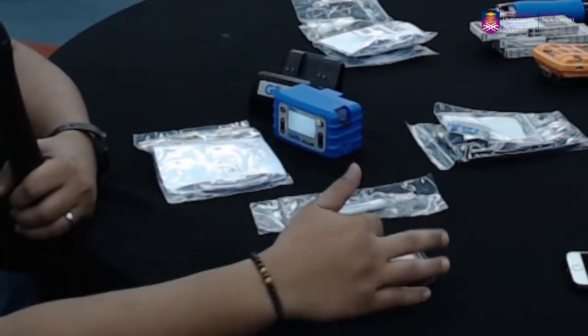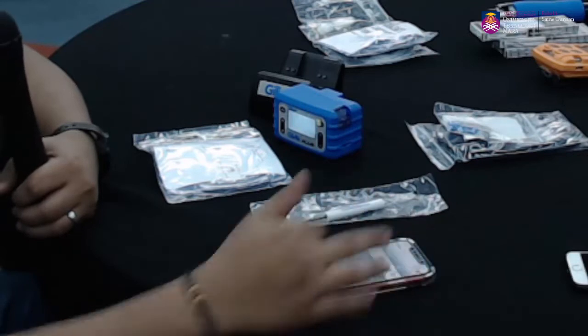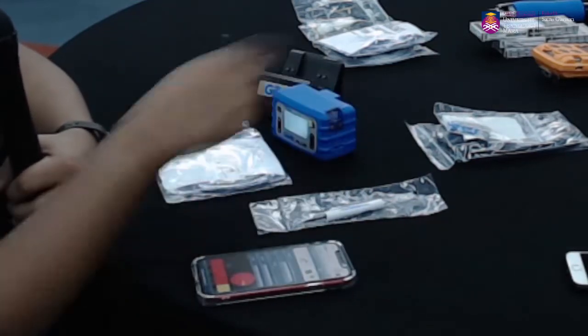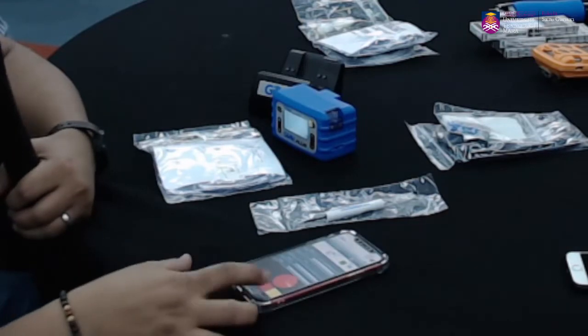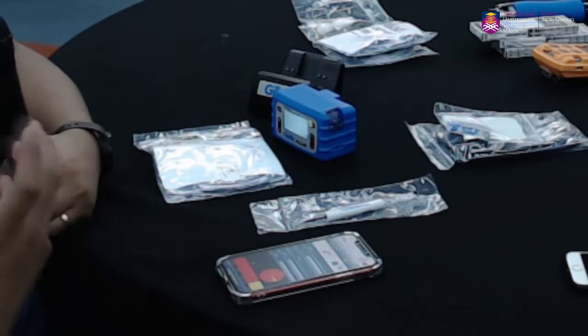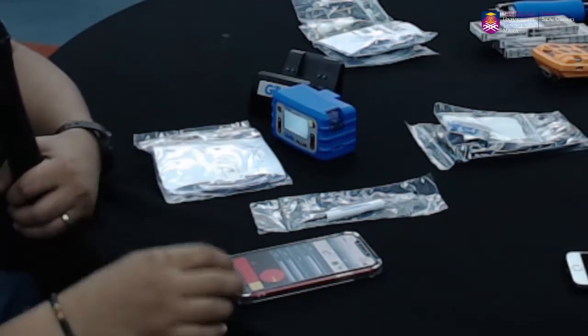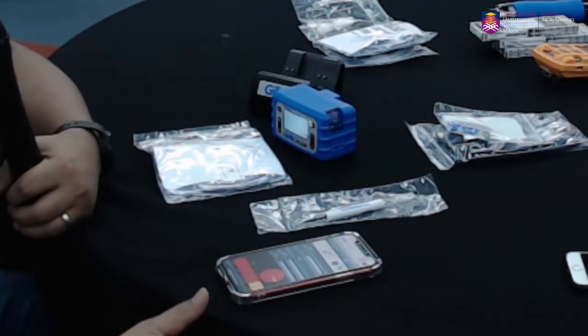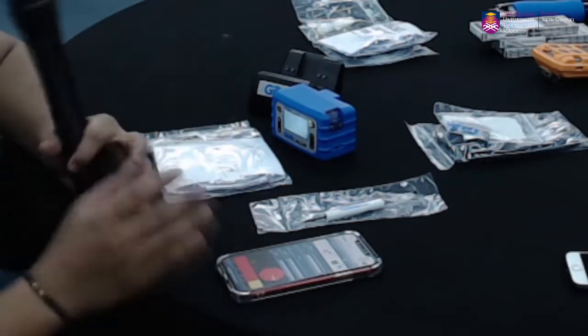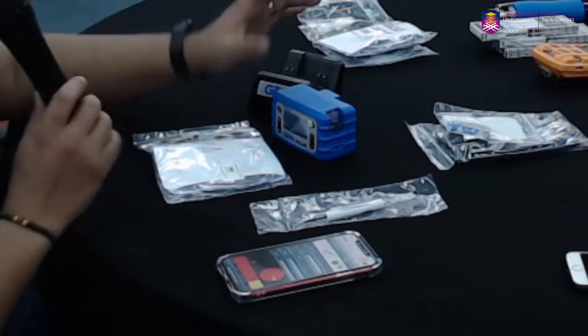And then in terms of kita punya analysis tu kita boleh tengok lah, go through in terms of kita punya data yang kita dah accumulate. Contohnya kalau tadi I movekan it bit, so dia akan tunjuk kita in terms of dia dah stationary lah. So kalau contohnya dia actively moving, then means that dia ada steps count juga, dan daripada situ dia akan tunjuk green lah from this side. Okay. So that is the general part of kita punya air sampling pump.